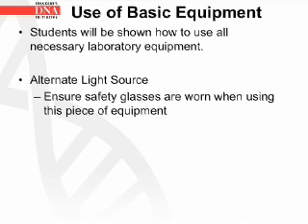Use of basic equipment. Students will be shown how to use all necessary laboratory equipment. Example, the alternate light source. You will ensure that safety glasses are worn when using this piece of equipment.